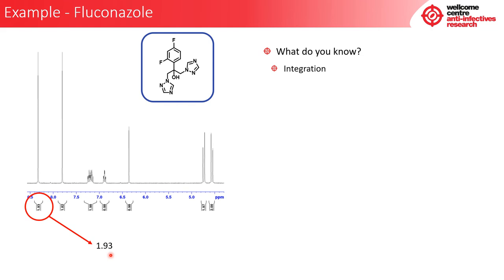And how should we start to write or annotate this on our spectra? Here, we just write H1 and H2. Now you're thinking, well, hold on a minute. What happens if it's a CH2? Then technically it's H1 and H1 prime. Well, we don't know that yet. We want to start to be able to use all of our knowledge to be able to fully understand what it is that we have in front of us. So if we were to do this integration to all of these peaks on the spectra, we start to see that we have 12 protons in the spectra.